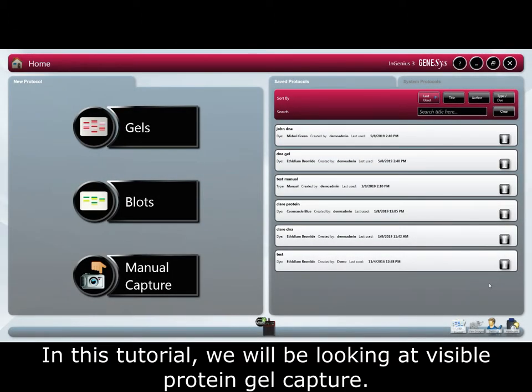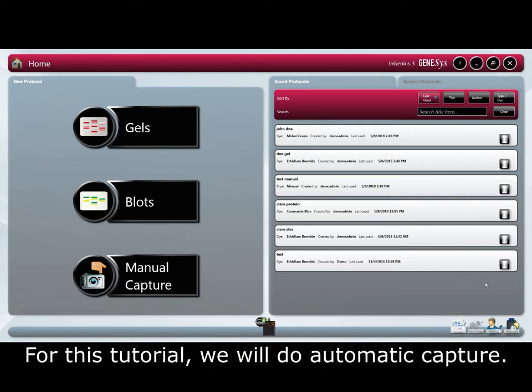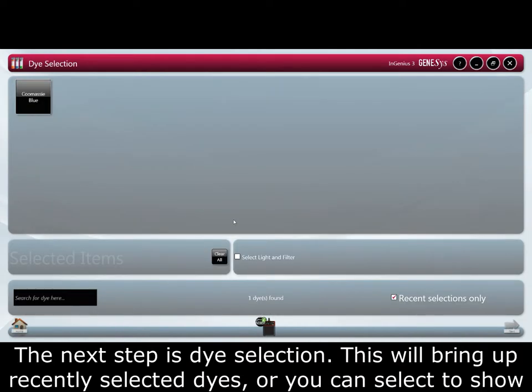In this tutorial we will be looking at visible protein gel capture. In Genesys you have two imaging choices: manually or automatically. In this tutorial we will do automatic capture. Select gels and visible protein gel. The next step is dye selection.